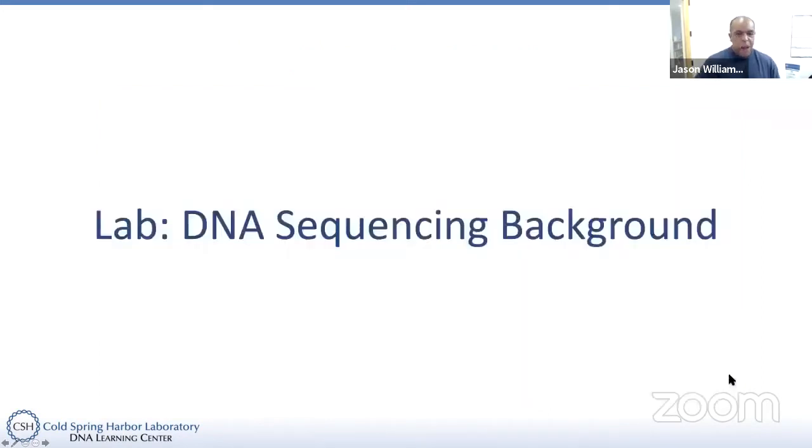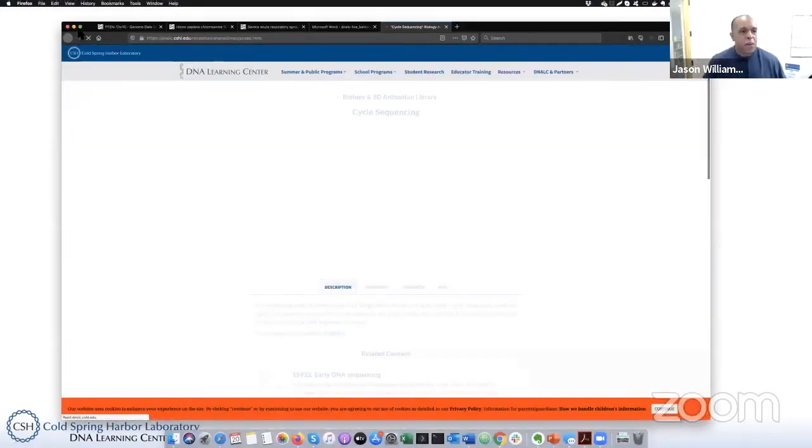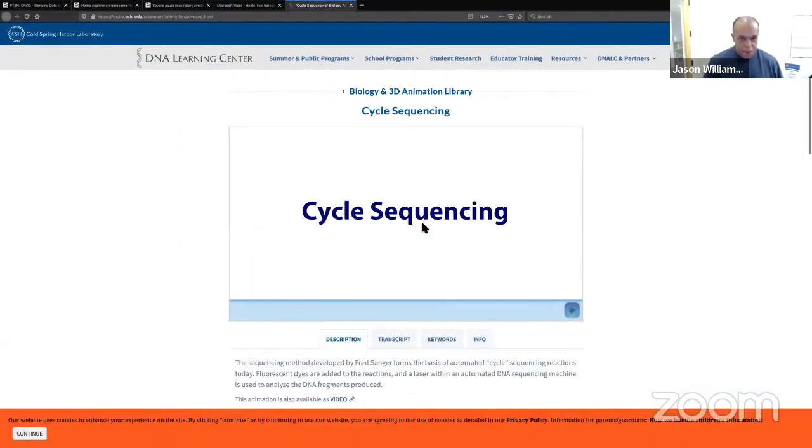Okay, so in order to wonder about these mosquitoes, we need to look at their DNA. And in order to wonder about their DNA, we actually need to understand how we get DNA. In order to tell you a little bit more about this, it's listed in the references. So if you downloaded the handout, you have it there. Or if you come to the Cold Spring Harbor DNA Learning Center website, you'll come to this description on sequencing.